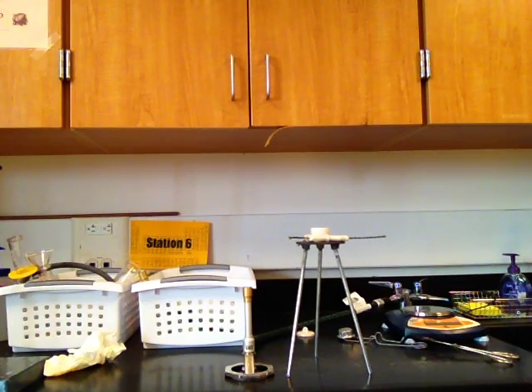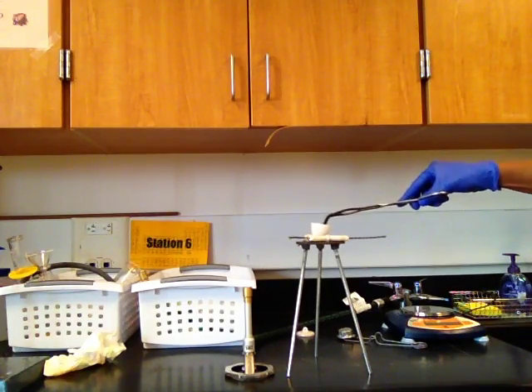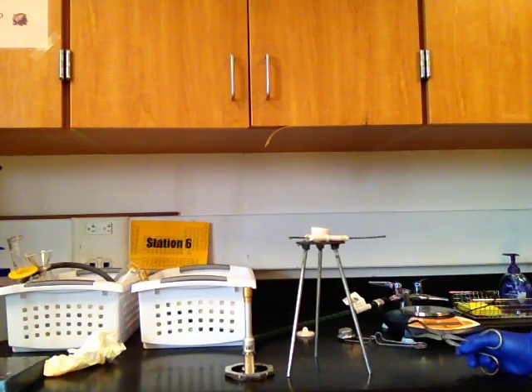A few things to consider here. Make sure your grip on the crucible is nice so you're not dropping the crucible, because if you drop and crack the crucible, you'll have to start the experiment all over again.